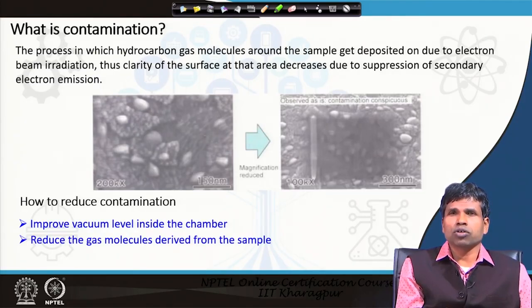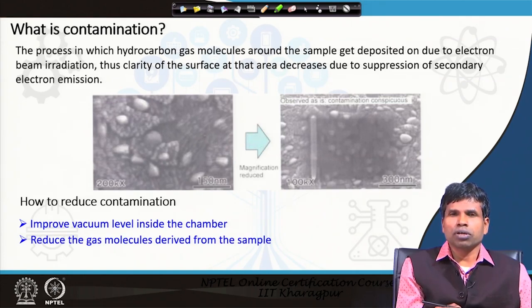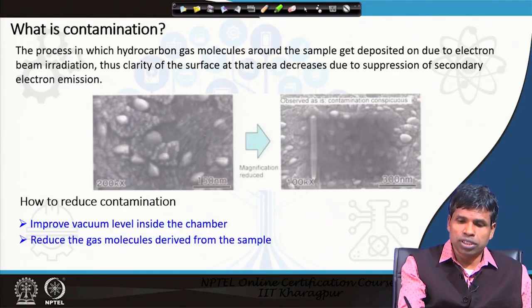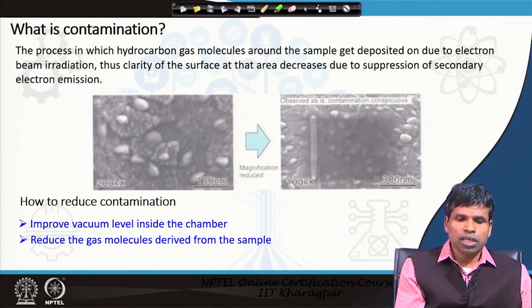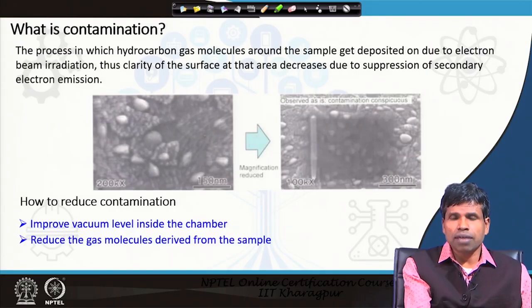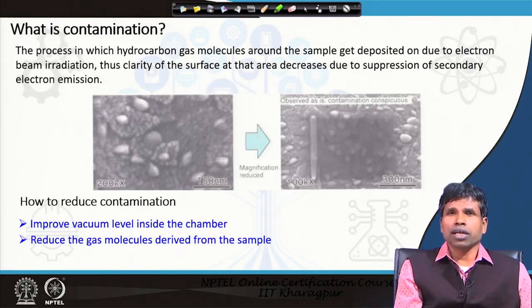This is what contamination is. The hydrocarbon gas molecules are present around the specimen in very small quantities, but still enough to produce contamination. In the presence of the electron beam, they give a coating on the specimen surface. Once carbon is coated onto the specimen, the yield of secondary electrons or backscattered electrons will reduce, and those regions will appear less bright or darker — as you see in the right-side image. The left-side image was irradiated for a little longer, and the right-side low-magnification image shows the same region appearing darker due to contamination.